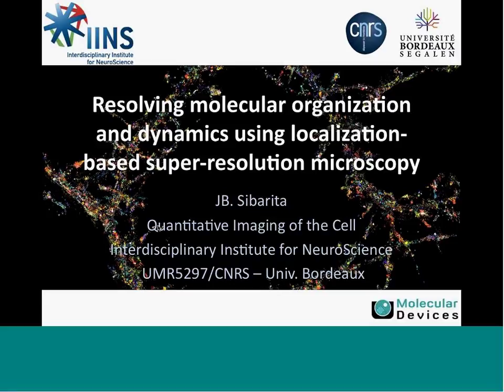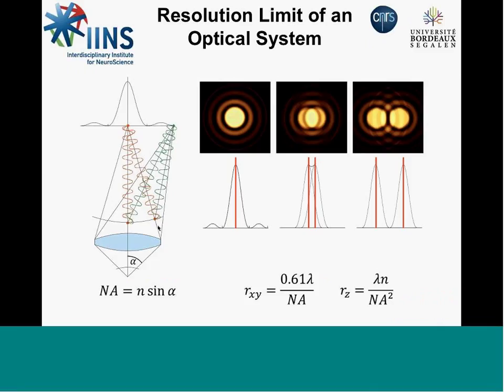Okay, so I will start with the very beginning. As you all know, of course, light microscopy is limited in resolution. This is due to the diffraction effect. It has the following consequence: if you look at a point through your microscope, what you will see is this diffraction pattern, which is known as an Airy disk.